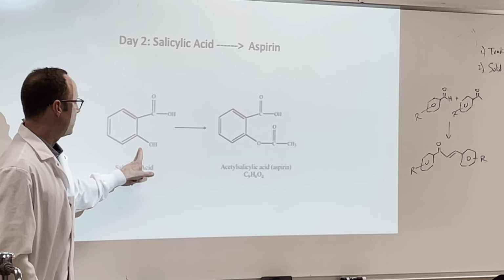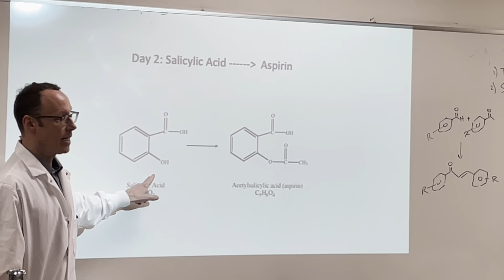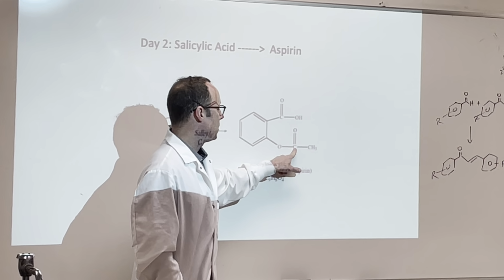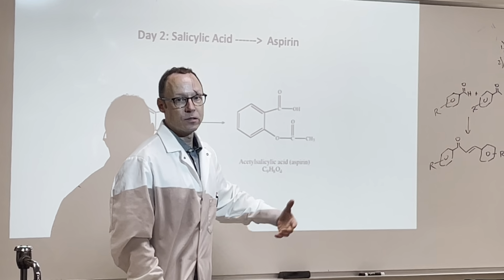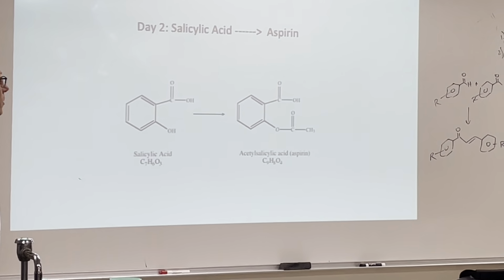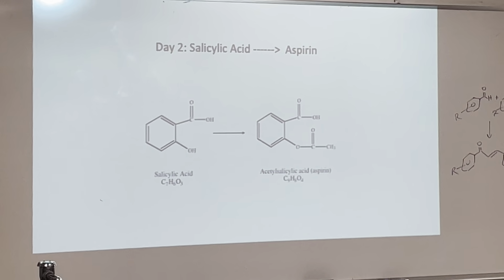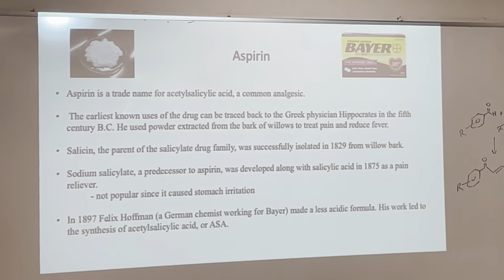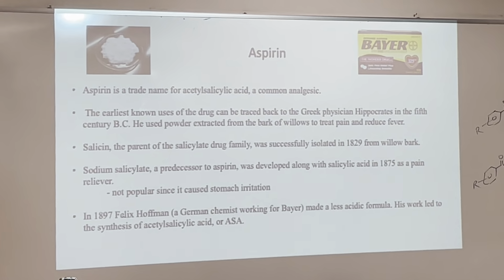So we are going to take the phenol of the salicylic acid and put on a 2-carbon ester group on it, what is called an acetyl group. All right. So just kind of an FYI. I'm sure you're all very familiar with aspirin by this point in your life.